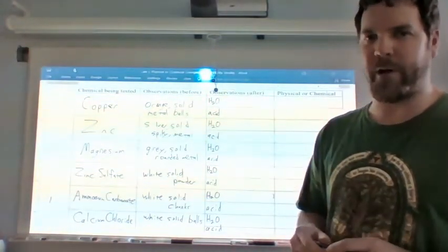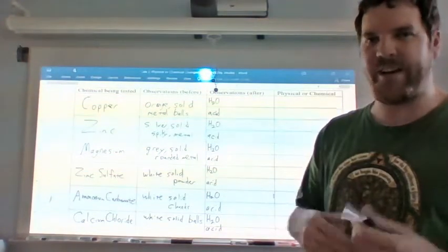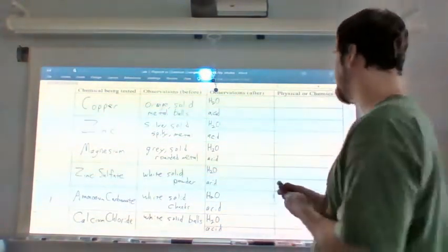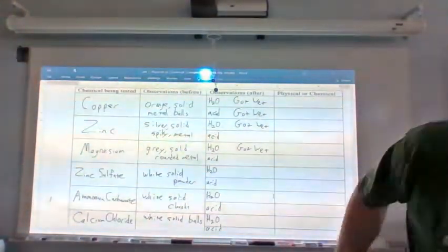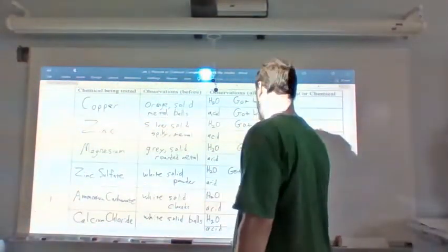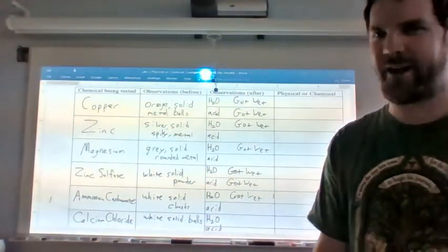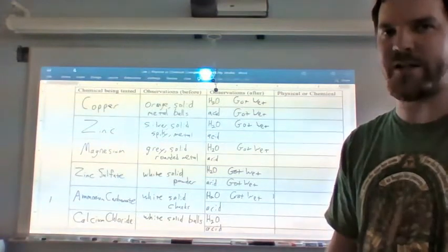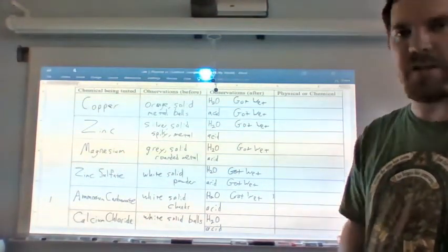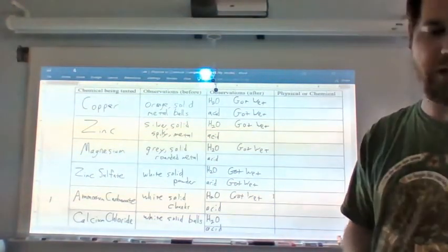Now basically what I'm going to write when kind of nothing happened is that it just got wet. So you might see one of the ones we haven't done yet is zinc with acid, and zinc with acid bubbled and got cloudy.